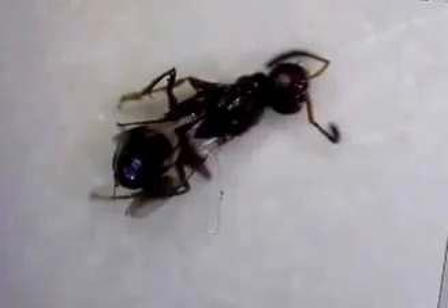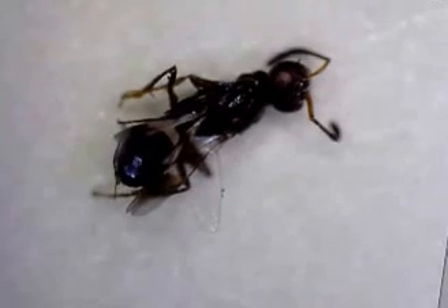Here's one more thing I want to show you — this is a little ant that we got outside a while ago. We had to look hard because we've had a couple of near frosts that killed off most of the ants. Here it is — it's a tiny little ant, one of the smallest I've seen. He's a winged ant — I didn't realize it until we magnified him. If this was summer with an unlimited supply of insects, you could go nuts checking out all the little details.